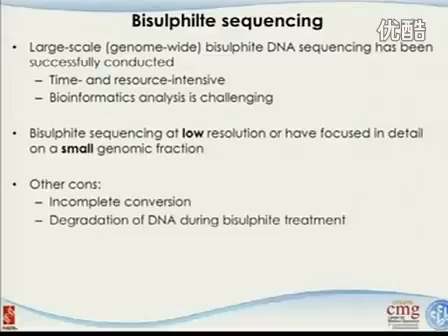So all these problems or difficulties I'm talking about are for the whole genome bisulfite treatment. Okay? There is another approach called the reduced library-based bisulfite treatment. I haven't seen too many publications, but actually there are some pretty established protocols on that.